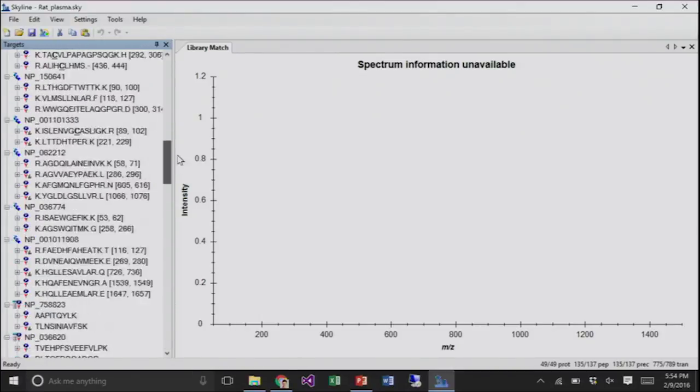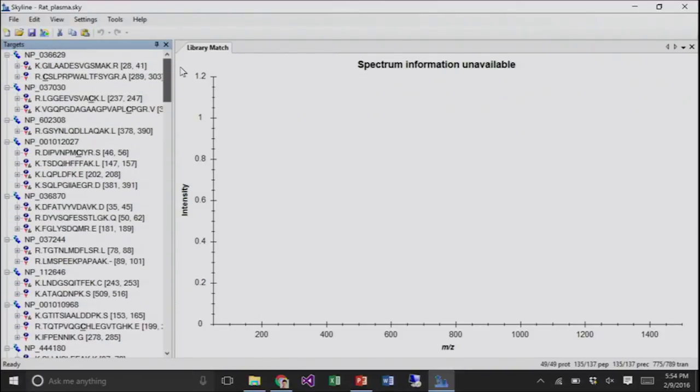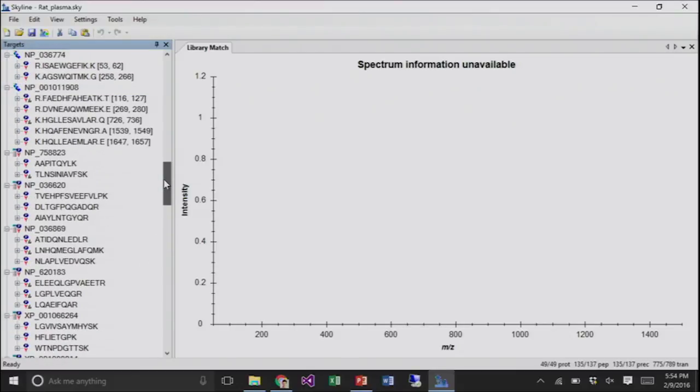So why shouldn't I just take the median? I measure all these peptides, I just take the median peptide and normalize everything else to it. That's something that people do in DDA experiments. So if I'm doing a big label-free experiment with MaxQuant or something like that, I can. Why wouldn't I do it for targeted? Do you have an idea?